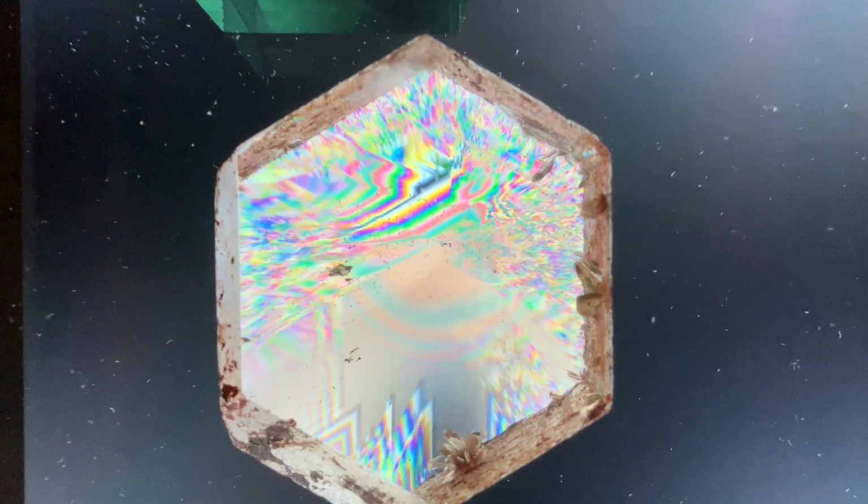For some quartz crystals, the entire crystal either is rotating clockwise or rotating counterclockwise. But for this particular crystal, the various rainbow triangles that we see are actually Brazil law twins. These are areas where the spiral staircase in our quartz crystal structure has actually flipped from clockwise to counterclockwise, or vice versa. When looking closely at areas of our quartz crystal without Brazil law twinning, we can generate a quartz uniaxial optic axis interference figure. But when we take a look at those areas with Brazil law twinning, things become much more complicated.